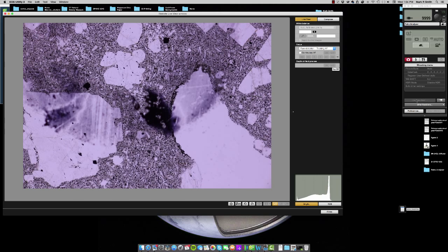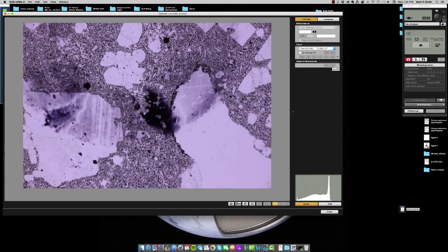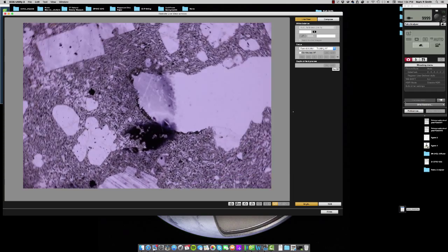5x of optical magnification is about 20x magnification when you factor in the resolution of the camera sensor that we're using today.